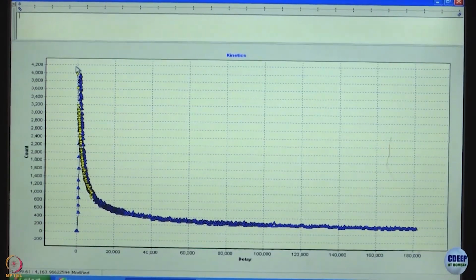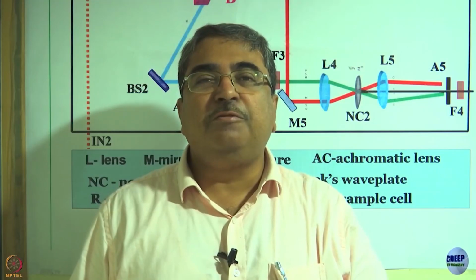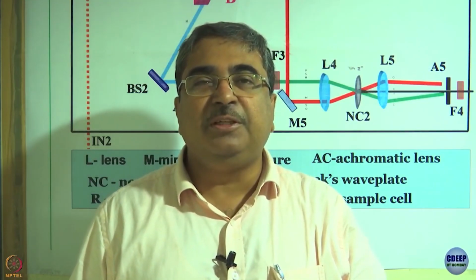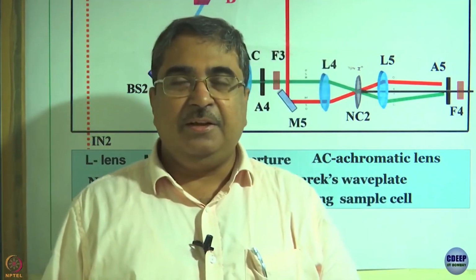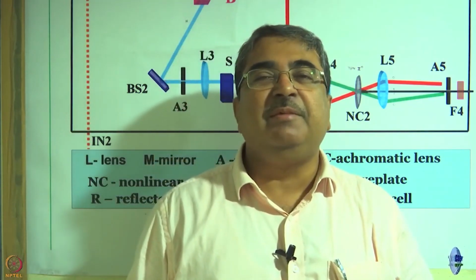To conclude this discussion, we have discussed in the lecture how the fluorescence upconversion technique gives you femtosecond time resolution, and here today we have given you some glimpses of how the experiment is actually done. The only thing that remains for you is to go to a lab and do the experiment yourself.